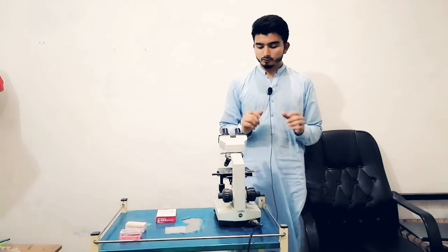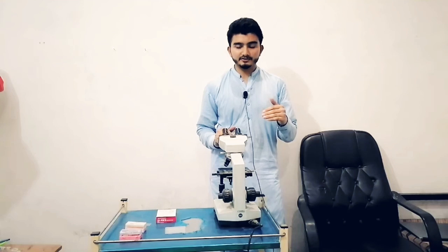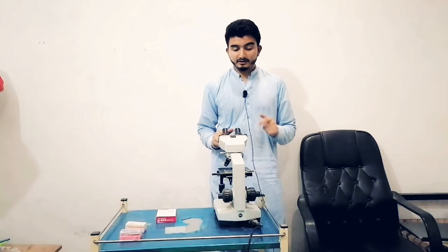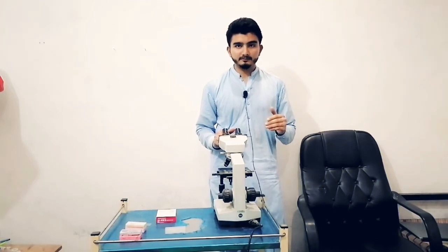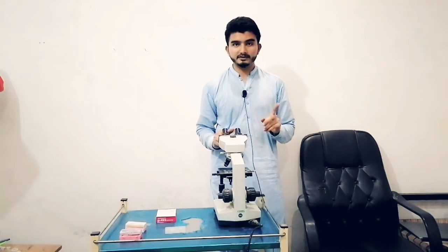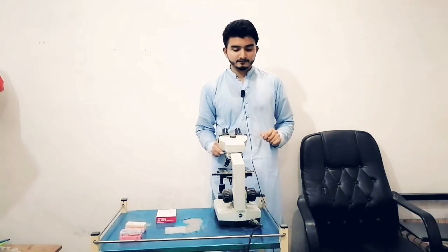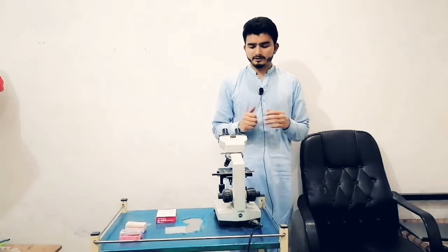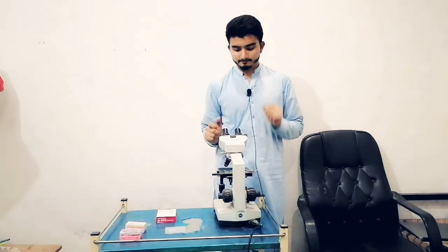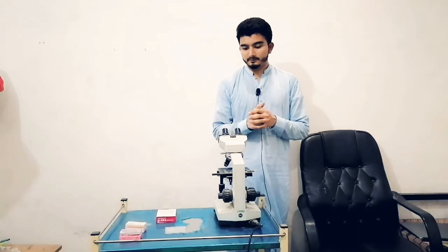So what is a compound microscope and what is an electron microscope? The compound microscope just uses light for the magnification and resolution of the sample, and the electron microscope uses an electron beam for magnification, and exactly, the electron microscope will make a 3D image while the compound microscope will make a 2D image. Okay, so that is the difference between the compound and electron microscope: the compound microscope uses light and the electron microscope uses an electron beam. The compound microscope is also called the light microscope.